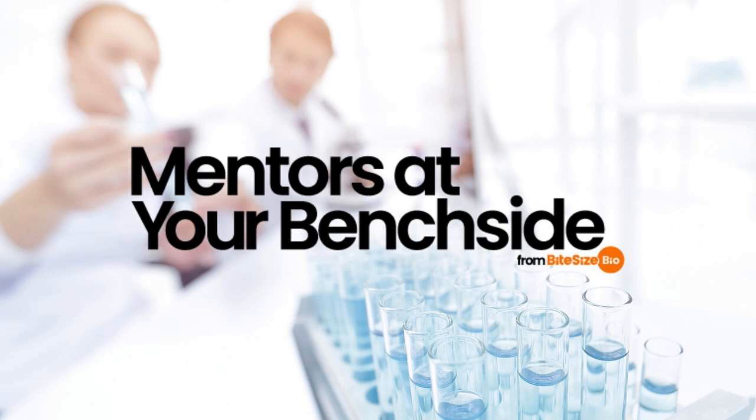The Maxam Gilbert sequencing method was widely used in the early days of DNA sequencing, but newer and more efficient sequencing technologies have since taken over. Yet it still has some niche uses, plus in the historical context of DNA sequencing, it's hugely important. A very short history of two DNA sequencing methods. First, let's have a little bit of history.